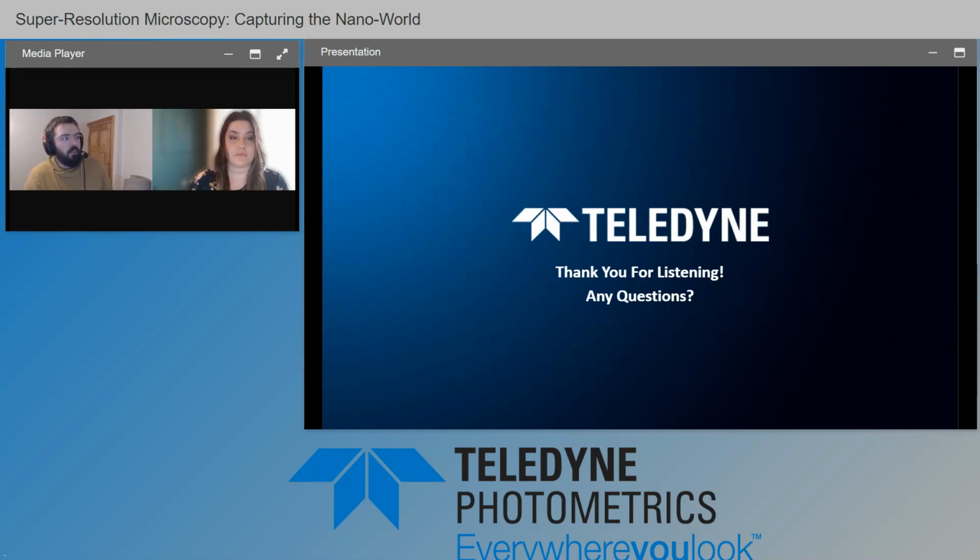Yeah, essentially, most of these are simply a different version of wide field fluorescence microscopy. Where we say wide field microscopy is simply bathing the image in light, but then I'm talking about it in a sort of fluorescence angle where you're getting a fluorescence back from the sample. So something like SIM, you're looking at fluorescence images most of the time.